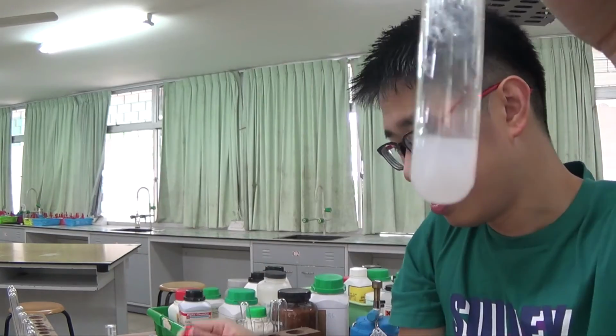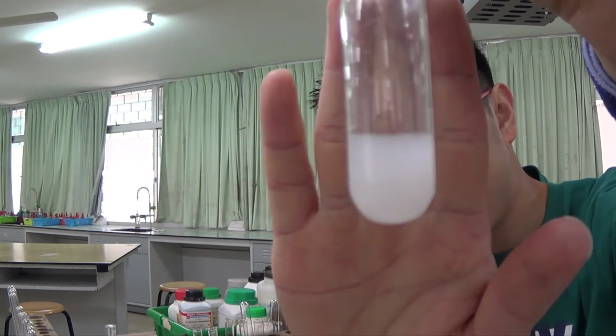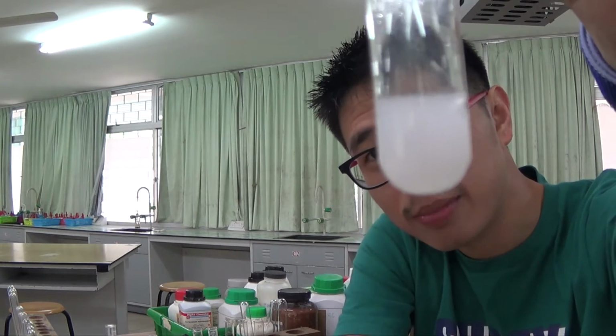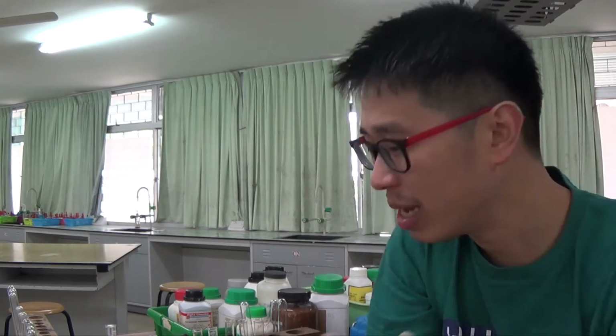What do you see? Now you have a white precipitate. This is very clearly a precipitate. You cannot see my hand behind me. You cannot see my eye behind, well, one of my eyes. Okay, so that means this is a white precipitate.